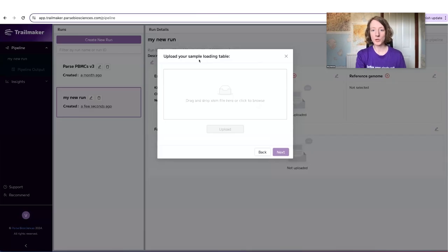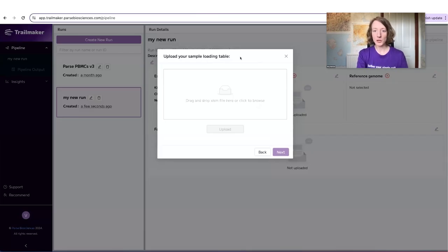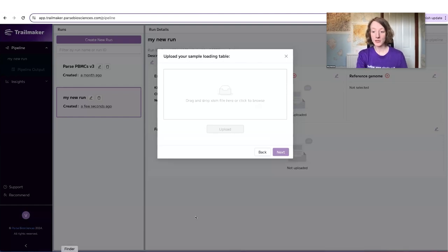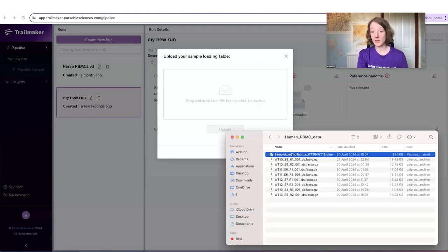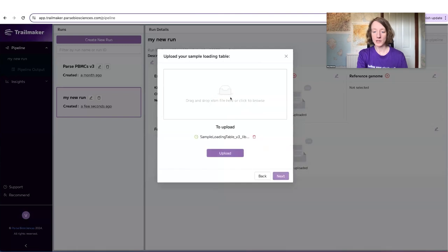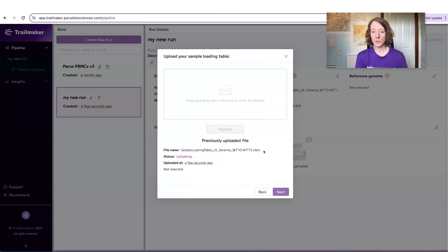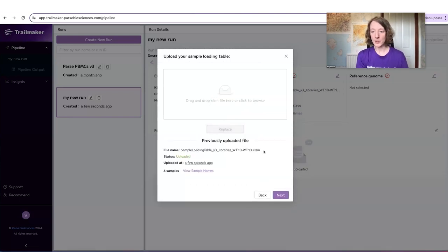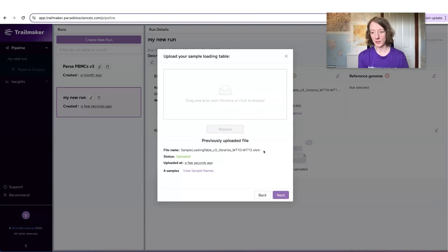In the next step, you upload your sample loading table. If you're already a Parse customer, you will know what this is from the wet lab part of the experimental protocol. This is an Excel file that you can drag and drop into the platform. It contains your sample names, cell numbers, and other details from the wet lab preparation.